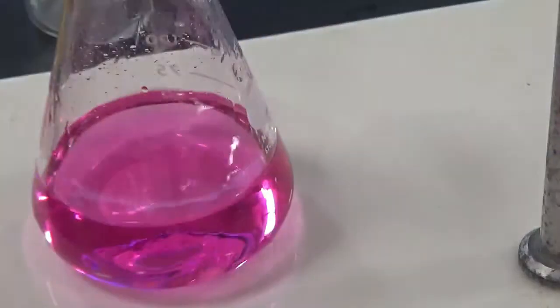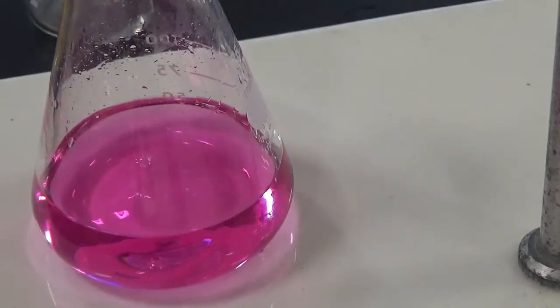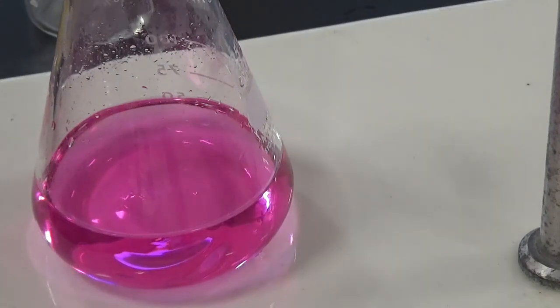Yeah, I really should have taken that reading before, but there, 1 extra drop. It's really bright. All right, whatever. When you do it, you should take the reading before you add the drop for the audience. Okay, so I'm reading this as 37.60 milliliters.